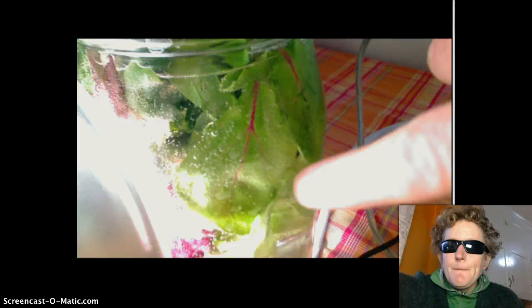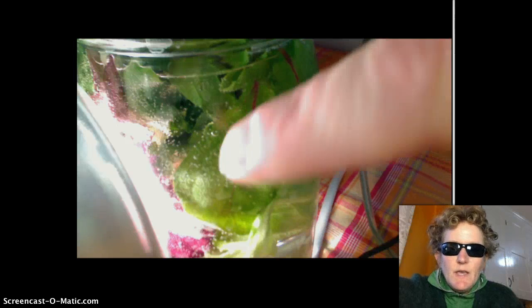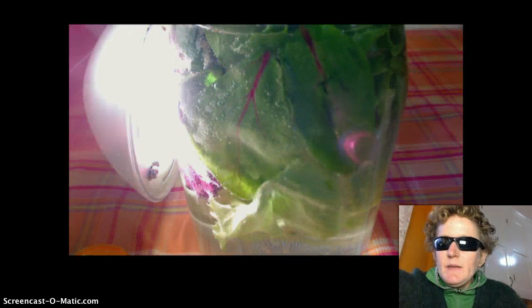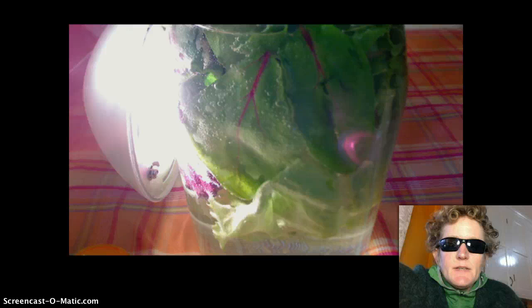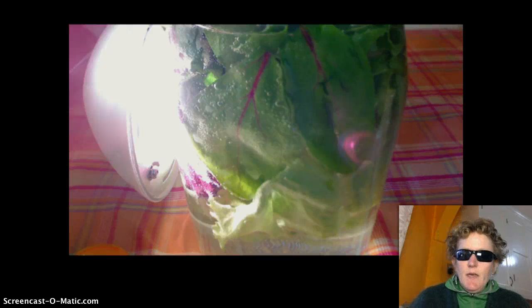Here I have a jar of lettuce and the lettuce is underwater with a light on it so that we can see as it produces oxygen gas in photosynthesis we can see the bubbles. If I wiggle it a little bit you can see the bubbles move and float to the top. I pulled the webcam back a little bit so you can see how close this light is. You need a lot of light intensity for this lettuce to photosynthesize. It's a little bit tired because it's been in the refrigerator for a while and it needs quite a bit of light. This is an artificial light so it doesn't have the same colors that sunlight does so it takes a little bit more of this light to get the plant to photosynthesize. But you can see how close that light is and this light is very hot.